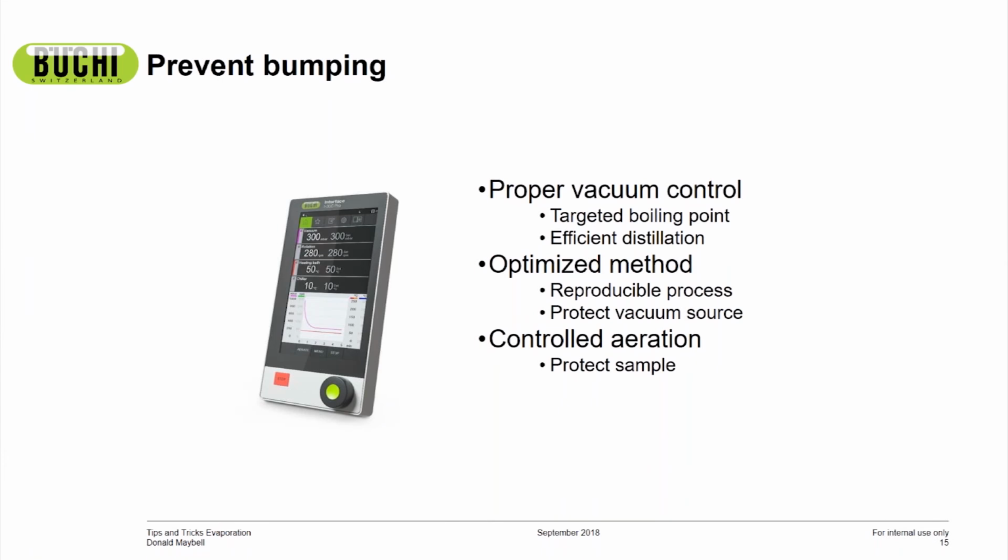And you protect your vacuum source. A lot of people, if they're not using a vacuum pump, use a house vacuum as well. So every vapor that gets through your system that's not being condensed by the condenser goes straight into the house vacuum source. If you break the house vacuum source, not only does it break it for you, but it breaks it for everybody else that's using it. That's where the proper condensation comes into play, and it's a really good thing to practice in any laboratory.